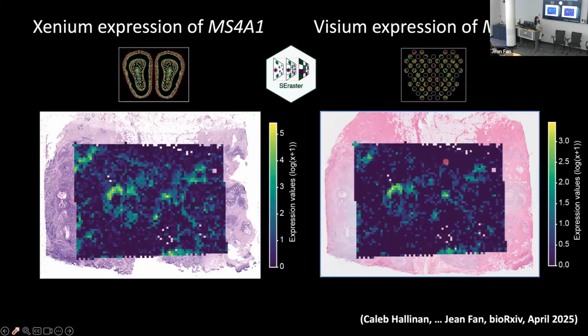And for the most part, we see pretty good spatial correspondence. And yeah, these are B cells. So presumably B cells are organized in these regions of the tissue. And we can further quantify that, again, using the approaches we've developed before.